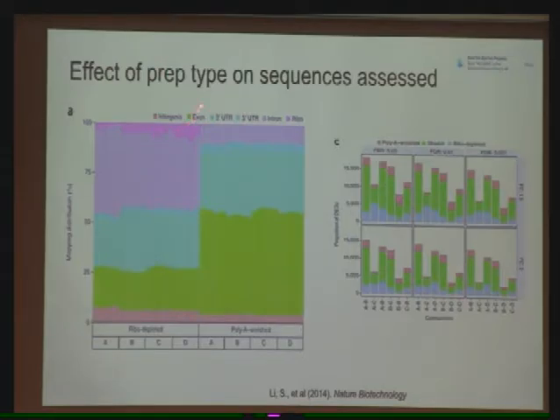So that makes a big difference when you go to quantitate your data, because you first start out with your raw sequence reads, and then some fraction of them align. Usually it's a pretty high fraction, somewhere around 90% of them align. And then from that, some fraction of them cover the protein coding regions that you're interested in.